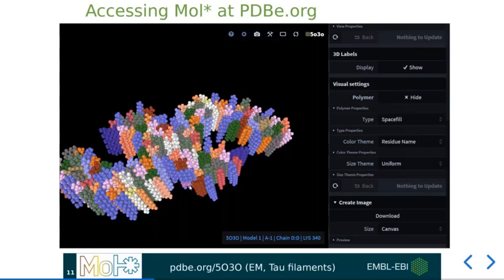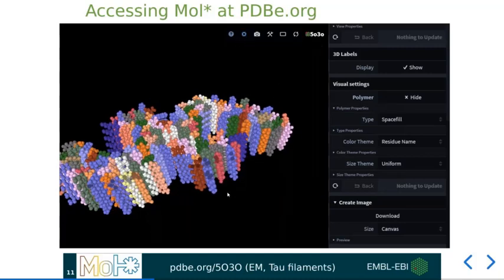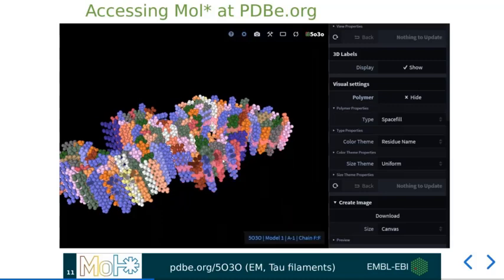Lastly, should you hover the mouse over certain areas of the structure or tap with the touchscreen device, you will get selection information about this part of the protein in the tooltip shown along the bottom of the screen. Should you wish, you can also change the granularity of the selection in the advanced options, where we can alter the selection mode, for example, distinct chains. Now, if I hide that advanced option, you should be able to see that I can now select distinct chains entirely, and that this information is also presented in the tooltip below.